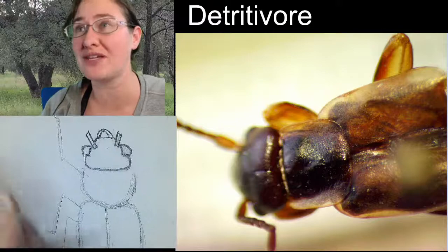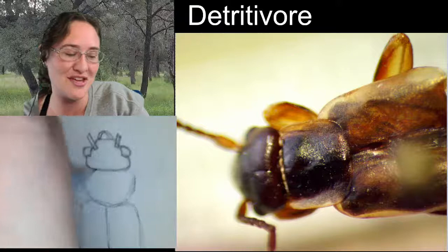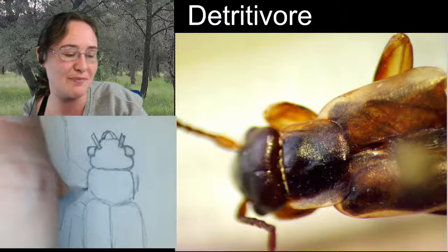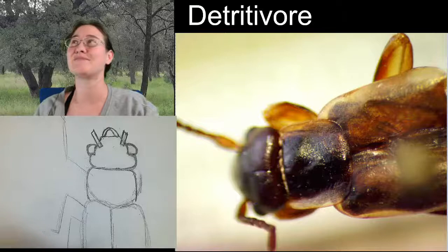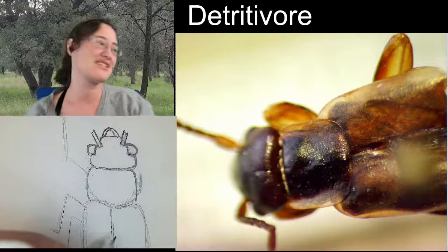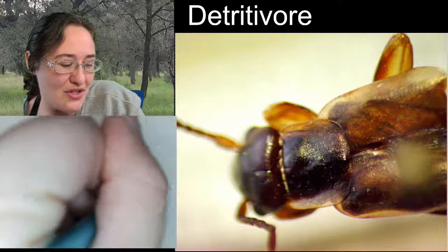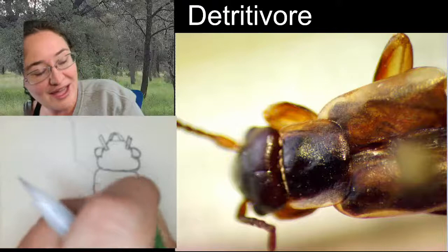These mites would be considered phoretic mites because they're not cleaning the exoskeleton or anything. They don't really benefit. They're just hitching a ride. And where they have found a place that's safe that the earwig can't knock them off is between the head and the pronotum. A lot of times you'll see commensalistic or phoretic mites on burying beetles, or sometimes you find pseudoscorpions connected to beetles and some wasps. I always love finding those phoretic guys hanging out on the specimens, because I've always thought it was kind of cool. It's always fun to see another living animal that's even smaller than the animal that you were collecting. Like, oh yeah, they get smaller.